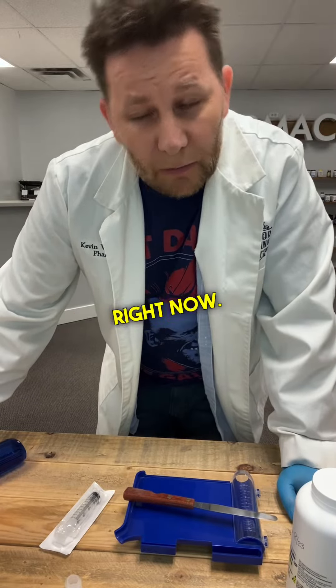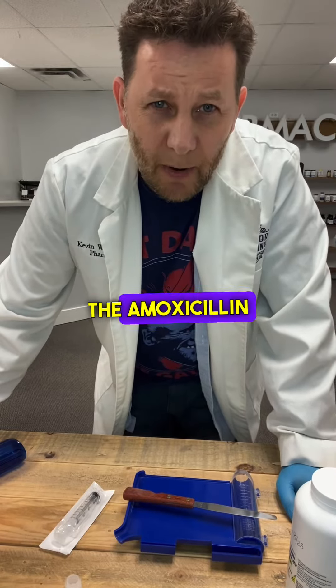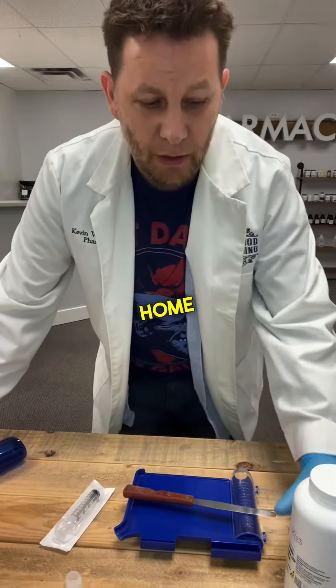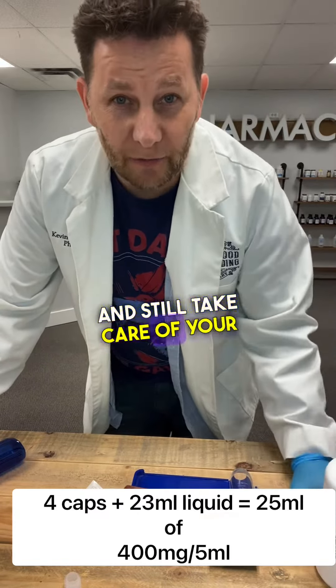Amoxicillin suspension is on back order right now. So there are a couple other antibiotic suspensions, but let me teach you how to make the amoxicillin suspension at home using the capsules. This way you can get a prescription for the capsules and still take care of your sick child.